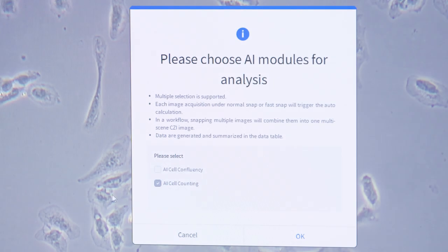Here's how it works. Start by selecting the cell confluency module in Zeiss LabScope.